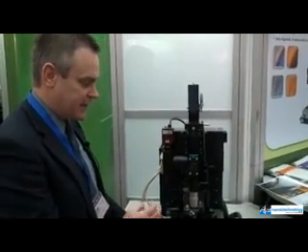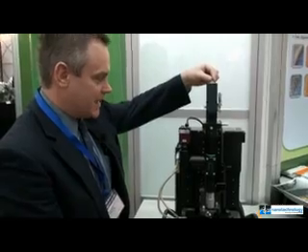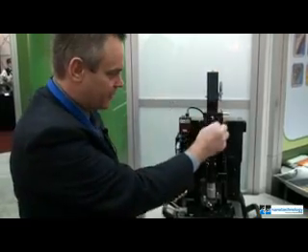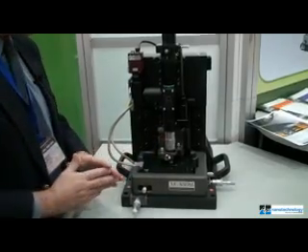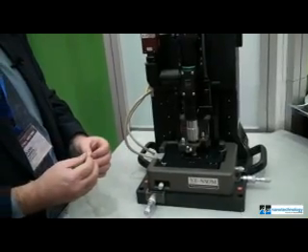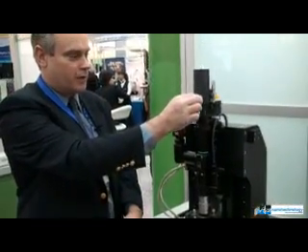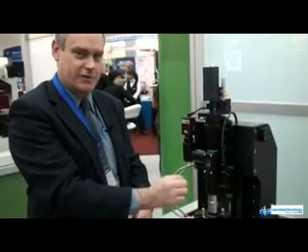The setup is combined with a laser — depending on the wavelength the user is interested in — which connects to the top of the column and is fed through the optical path to the cantilever, combining AFM technology with the NSOM. In this situation, aperture cantilevers are used, so the laser is brought down through an aperture in the back of the cantilever — essentially a hole drilled through the cantilever.